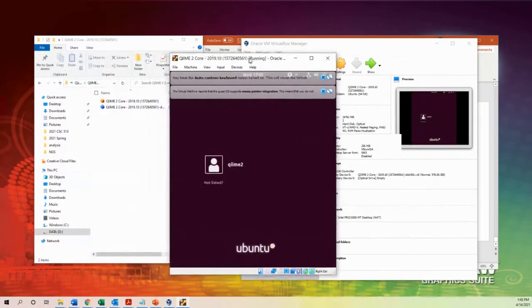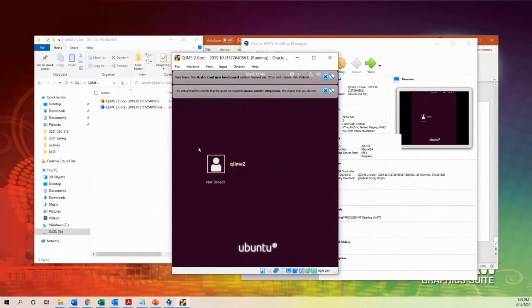All right. For those who already reached this step, you click this Chime 2. Then it will show you this option. Then you type the password. The password is the same as these words here, QIIME2. Okay, so you type QIIME2 and then sign in.